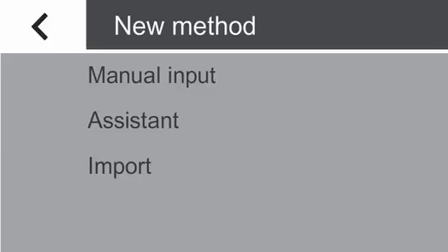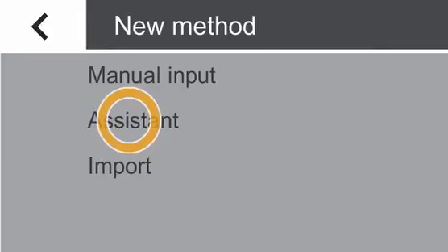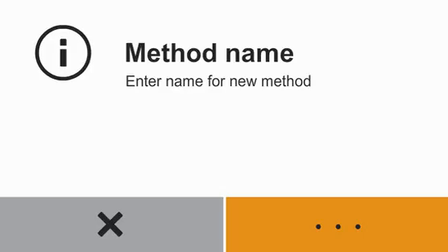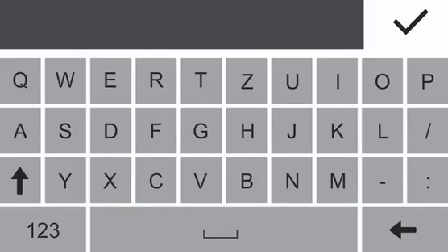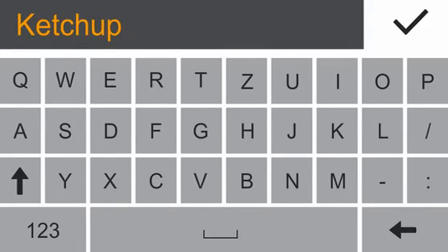Please select Assistant and follow the remarks on the display. Tap on the yellow button area to enter the method name. Please enter a unique name for your method so it can be easily identified. In our case, it would be ketchup. Afterwards, please tap on the confirm button.